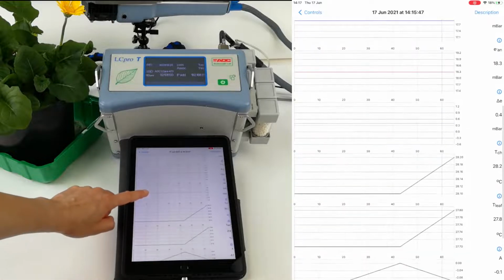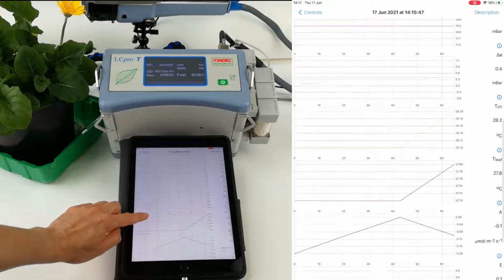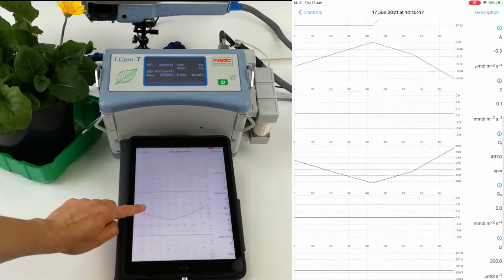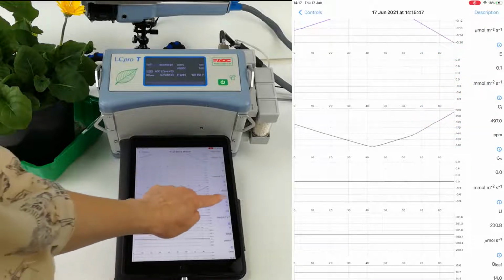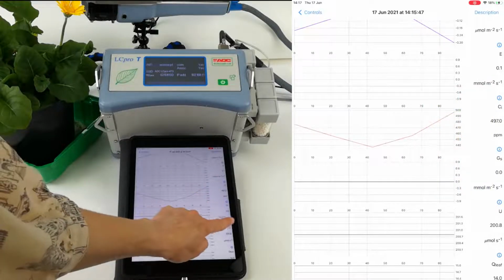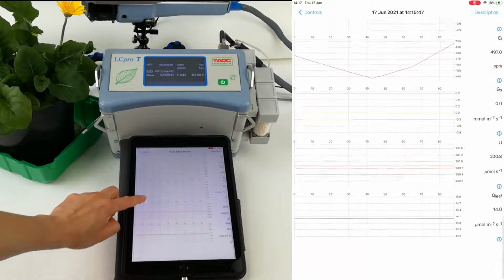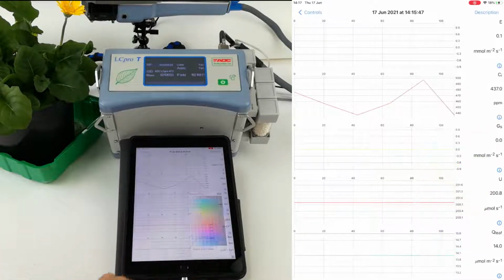Tch, broad chamber temperature, is followed by Tleaf in degrees centigrade. Assimilation rate or photosynthesis rate, transpiration rate, Ci, intercellular CO2 concentration, and Gs, stomatal conductance, are the four main calculated parameters most commonly plotted and studied. Flow rate, and lastly Qleaf, displaying the light received at the leaf plane.